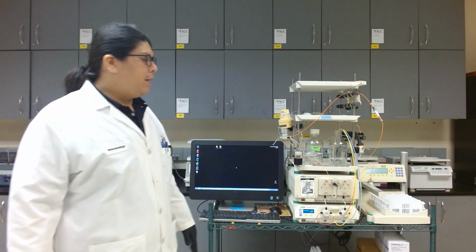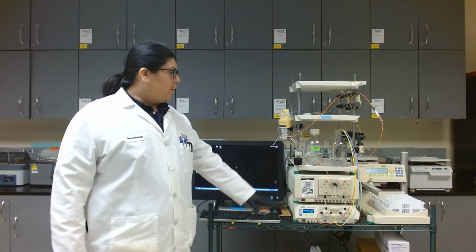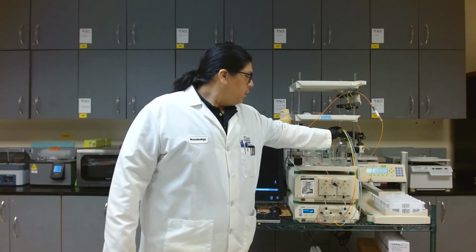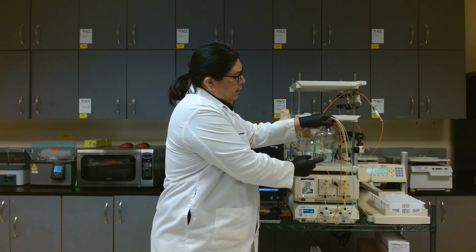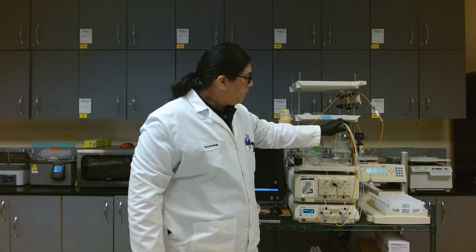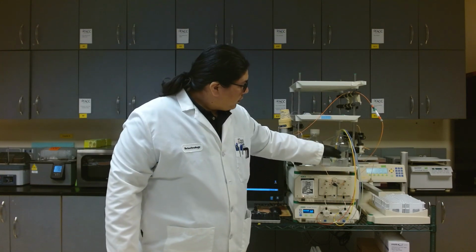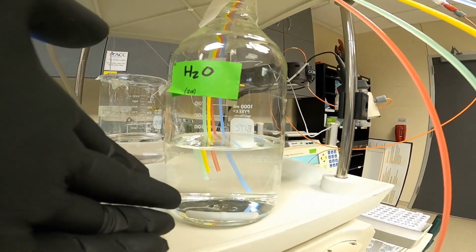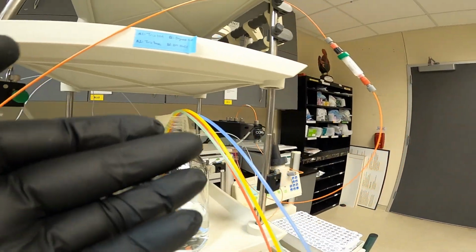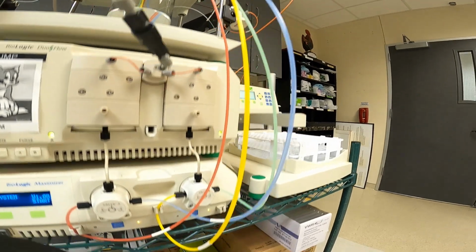All right, so we'll give these a minute to turn on and initialize, and while that's happening, I'll give you a brief overview of the system. So here we have our buffer tray. This is where our mobile phases will sit. You can see here we have our inlet lines currently sitting in the 20% ethanol. Our inlet tubes are here, so this is where we'll draw liquid in. See all of our inlet lines submerged there.